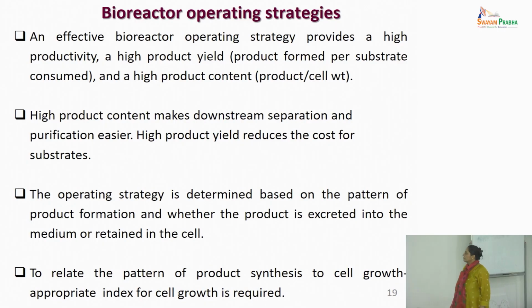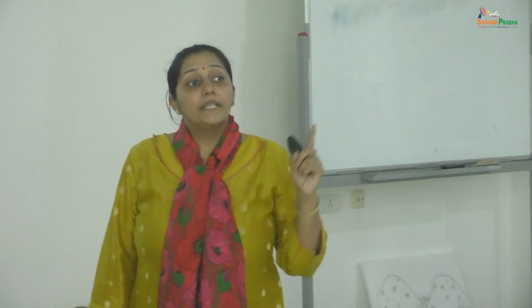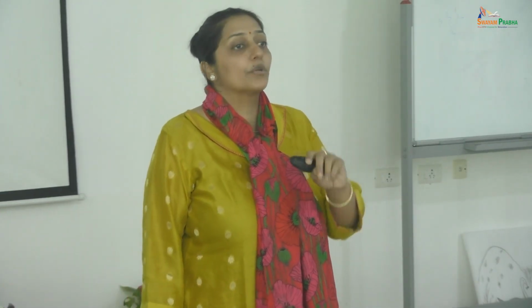The operating strategy is determined based on the pattern of product formation. That's very important. So, how do we determine that? From where will you get that knowledge? We had studied the cell kinetics in the shake flask, which will help you know whether your product is growth associated, non-growth associated, or mixed growth associated.